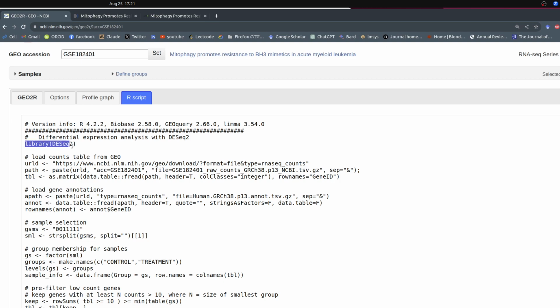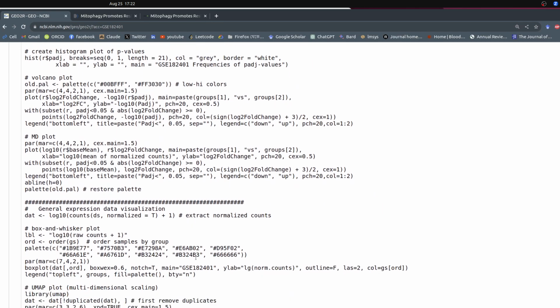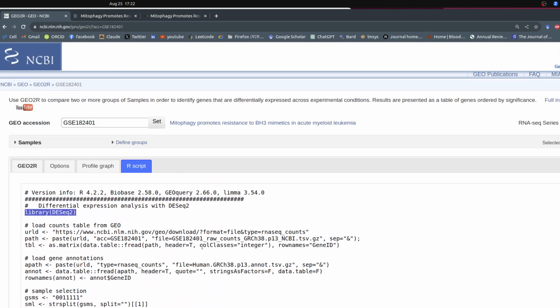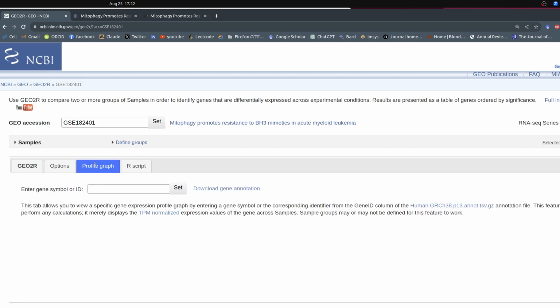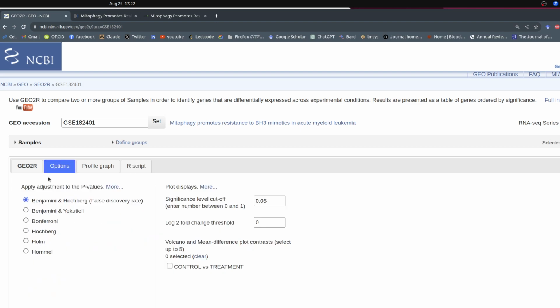And for this analysis specifically they have used R-based DESeq2. If you're interested in this entire script, probably you are not using this facility, so either way, if you have interest, let me know later. I will do the analysis and explain it letter by letter if you are interested. These are some of the parameters used here.